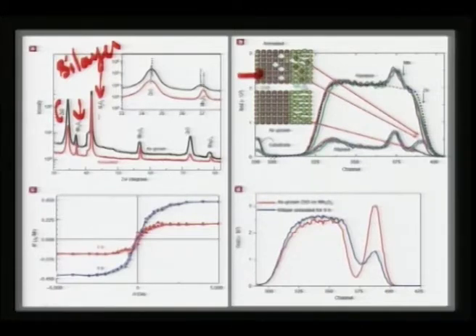As you see here, you have an intense peak for alumina somewhere here, but along with that you also have the zinc oxide peak here, and one would observe, even for the 2% manganese oxide doped one, that this is clearly not Mn3O4. Over and above zinc oxide, if we put a Mn3O4 layer, then you can see these signals coming here, corresponding to Mn3O4.